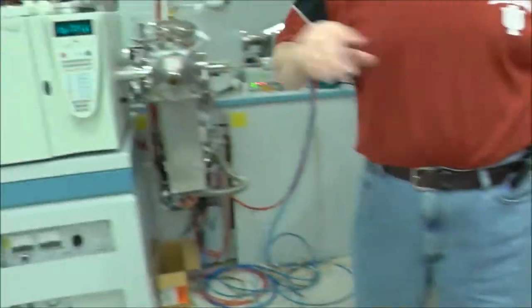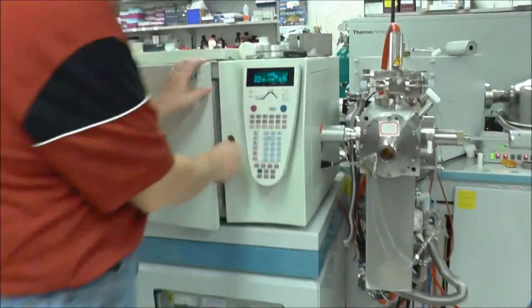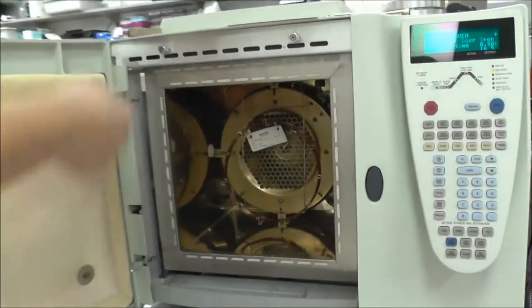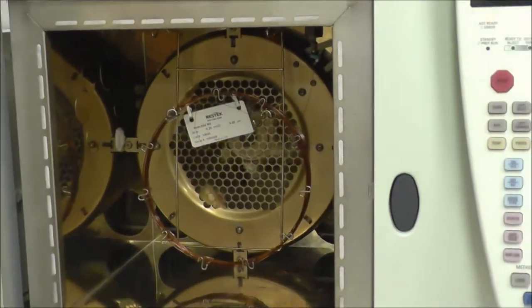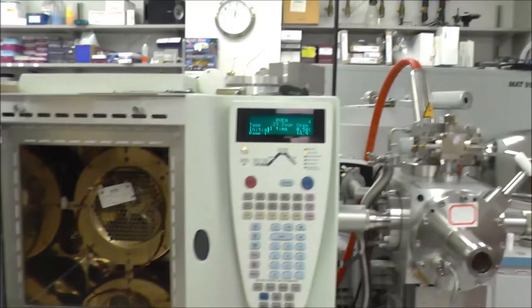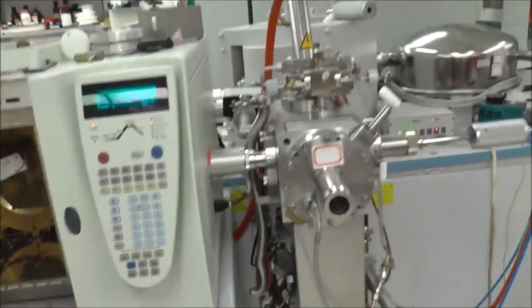And the machine, this little column actually goes in this little machine right here. So this is an oven. Our sample goes in here, oven warms up, molecules will go through that column, and then we measure their mass with that big magnet there in the corner.